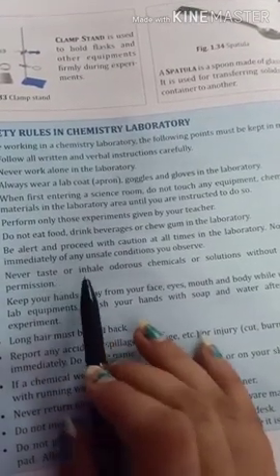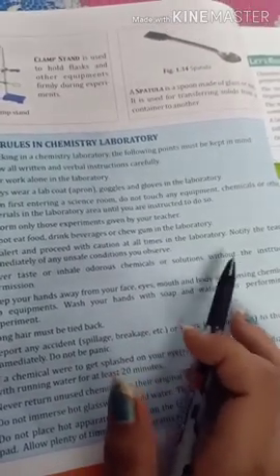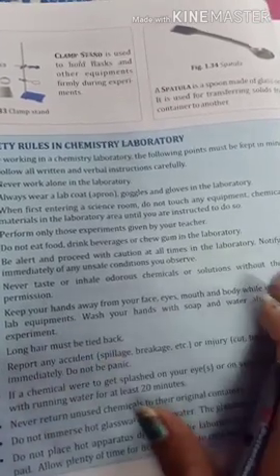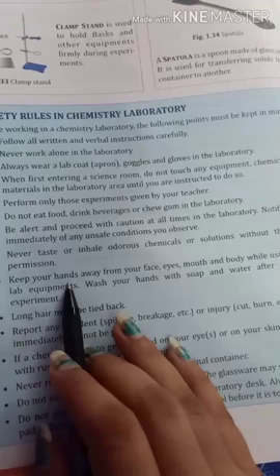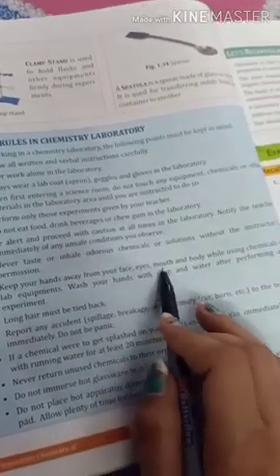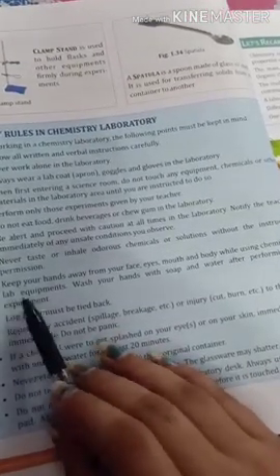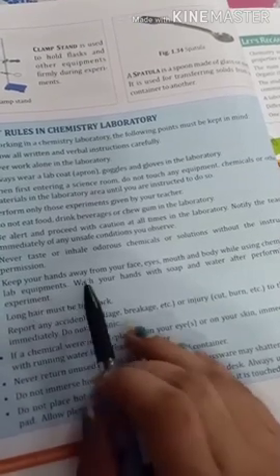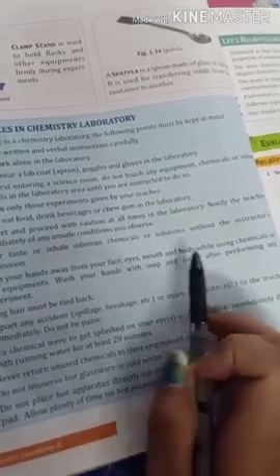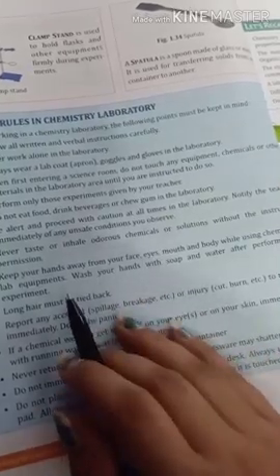Never taste or inhale odorous chemicals or solutions without the permission or instruction of your teacher. Keep your hands away from your eyes, face, mouth and body while using chemicals or while using lab equipment. Wash your hands with soap and water after performing an experiment. So wash your hands after doing experiments.